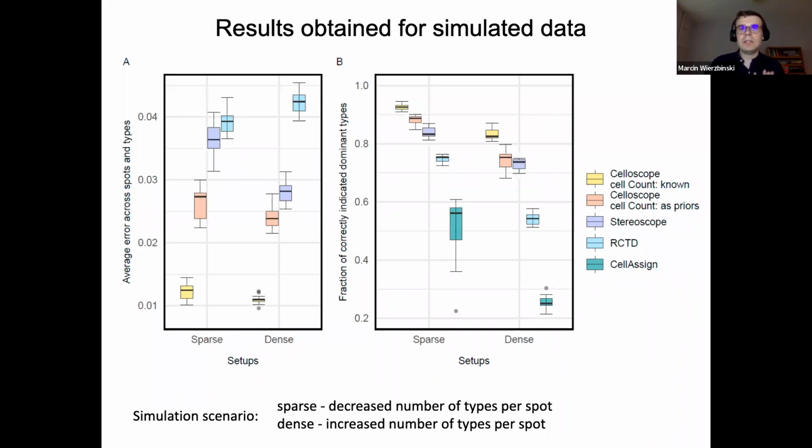Here we can observe the bar of error, the median of this is in this place, and the distribution of this error. From this side we can observe that the distribution is very high, so it's a very accurate performance.